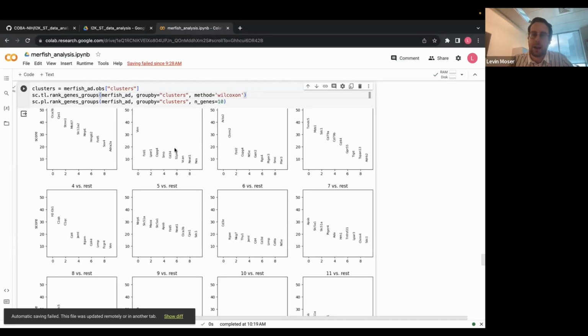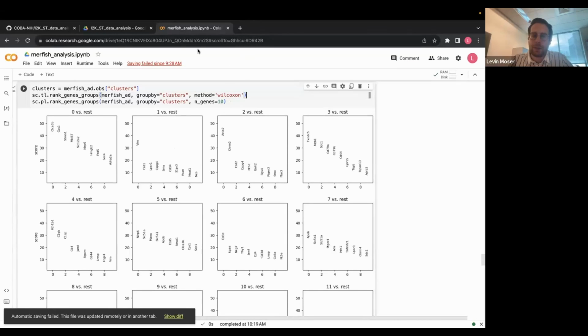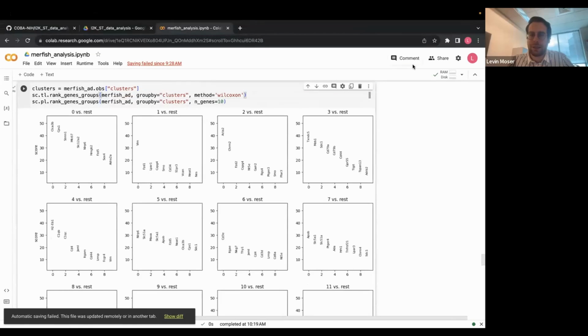And I think that's why you end up in a situation like what you described, where you can have higher rankings but lower scores. And these rankings are also always one cluster versus the rest of all clusters. Yeah, I hope that clarified it somehow, or?